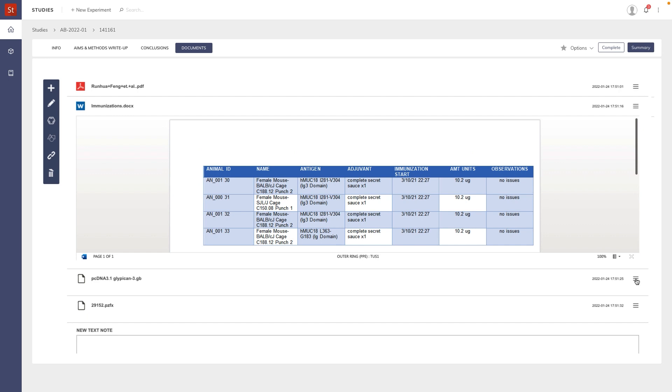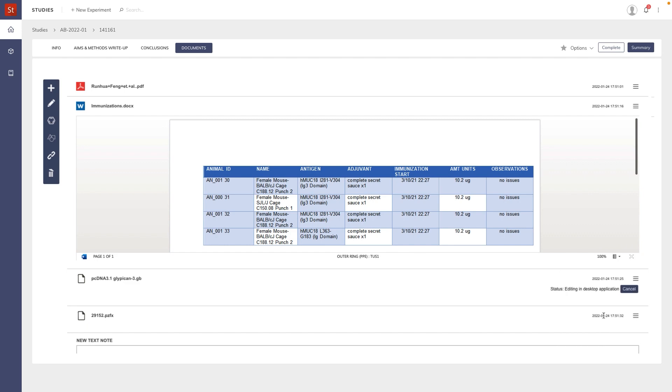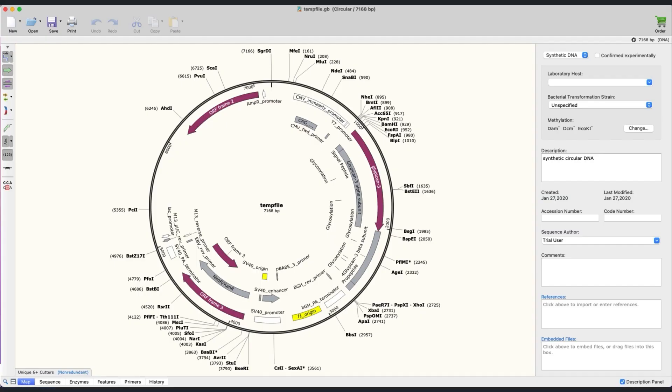Finally, for the GenBank file, which on my machine is associated with the SnapGene program, again I can open and if necessary make changes and save back to the ELN.